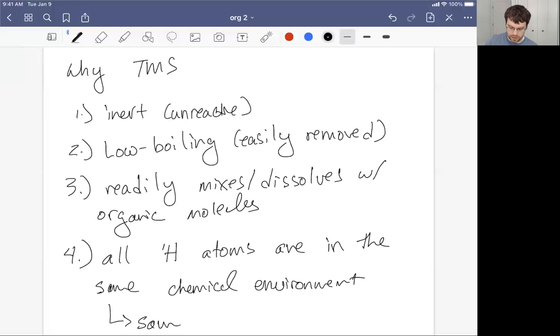And that's also true of the carbon atoms. Okay, so remember carbon atoms, we can only study carbon-13, so we just rely on the naturally abundant carbon atoms. It's not like we're just riddled with carbon-13 atoms, whereas for the most part, all hydrogen atoms present are an NMR active isotope, hydrogen 1. Okay, but what's cool about TMS is that every single one of the carbons are in the same chemical environment. Every single one of the hydrogens are in the same chemical environment.